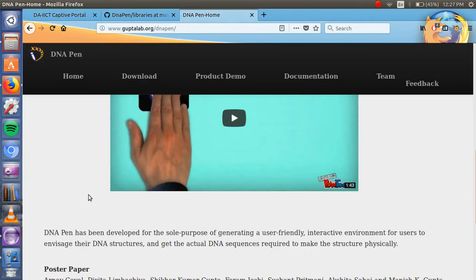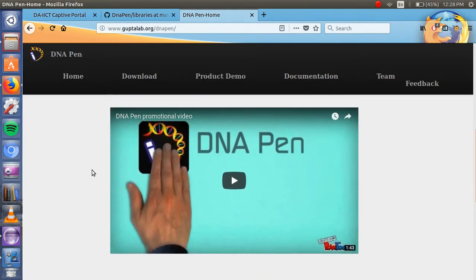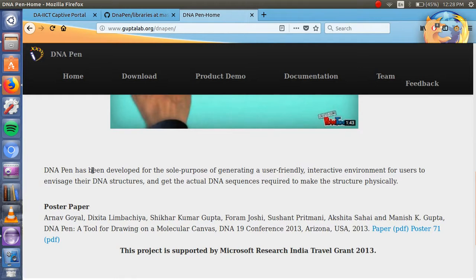Hello friends, we will be discussing the project that we developed for the IT 468 Natural Computing course offered in DISCT. In this project, we developed add-on features for the DNA Pen software, which is developed by Gupta Labs. DNA Pen software is a user-friendly interactive environment for users to envisage their DNA structures and get the actual DNA sequences required to make the structures physically.